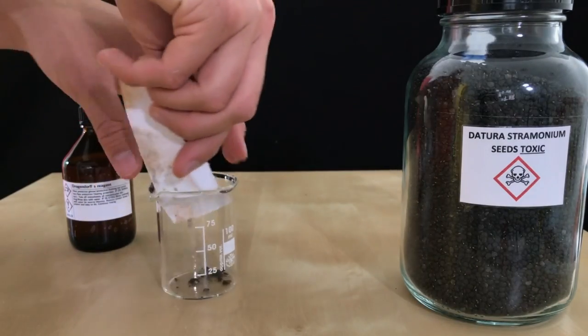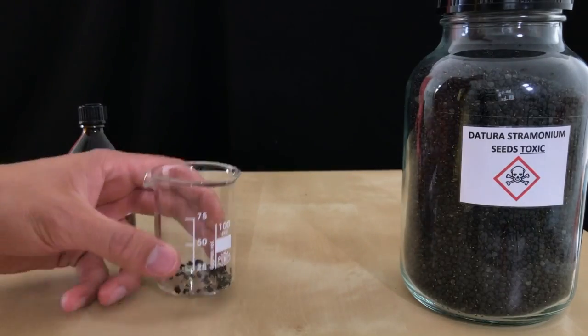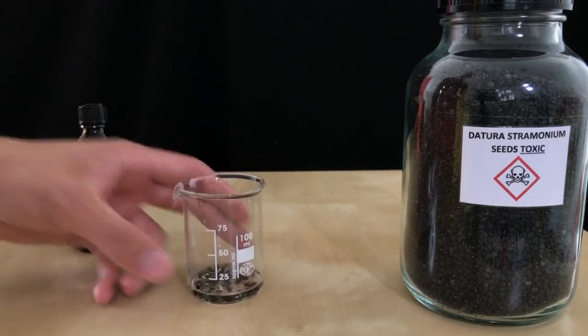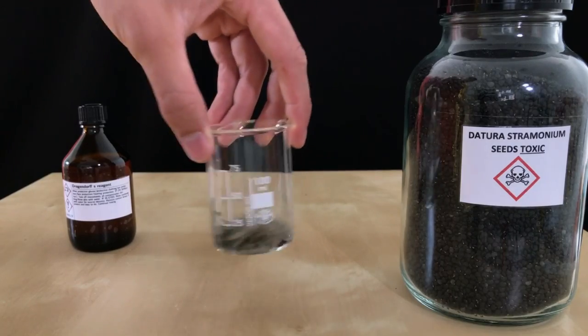Some crushed up Datura seeds were added to the beaker followed by about 10 milliliters of distilled water. To make all the contents wet it was swirled around a few times and afterwards allowed to stand like this for 5 minutes.